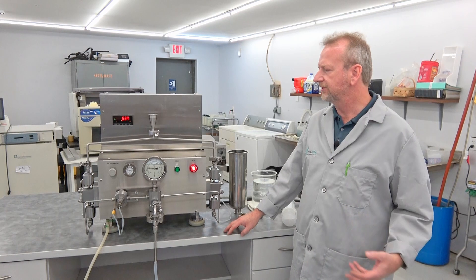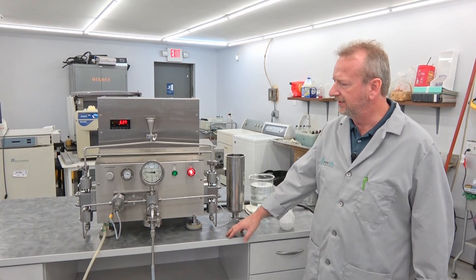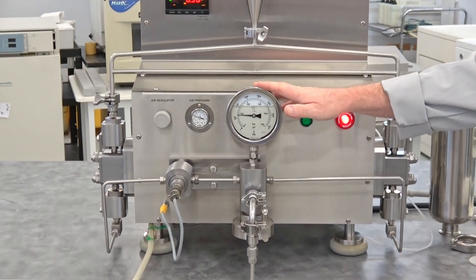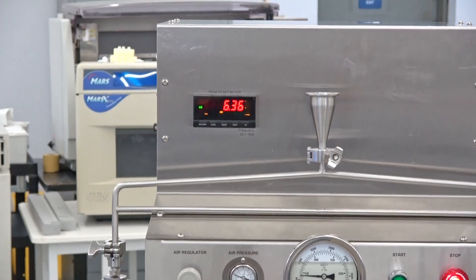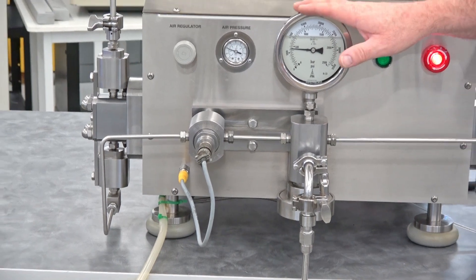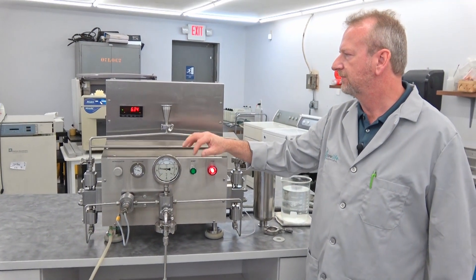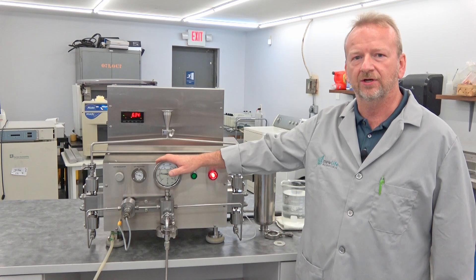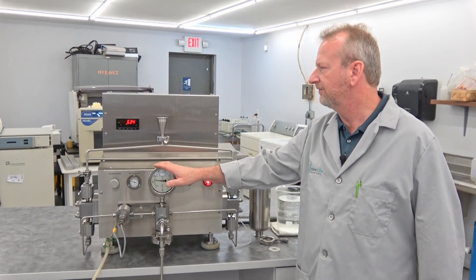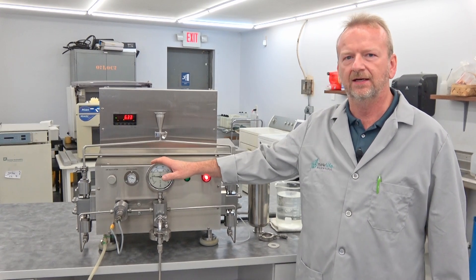I'm going to point out a couple of features on this one. It comes with two gauges — a manual pressure gauge that you'll see running, and another one up here that feeds pressure to a digital meter. The reason that meter is on here is that if it happens to go over 30,000 PSI — I think it's set at 31,000 PSI — it will actually shut the machine down so it doesn't damage anything. That's a nice option to have.